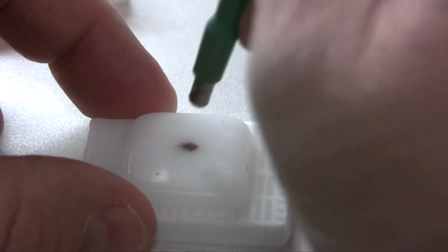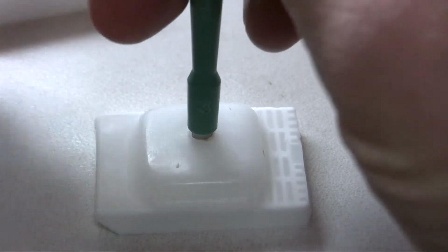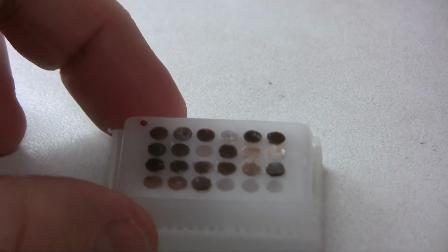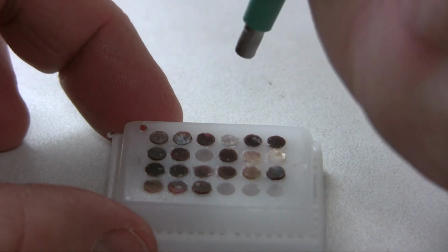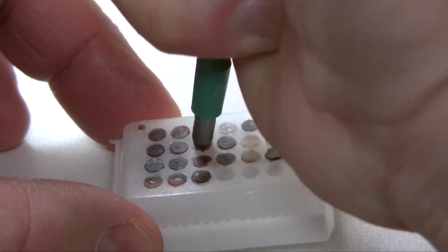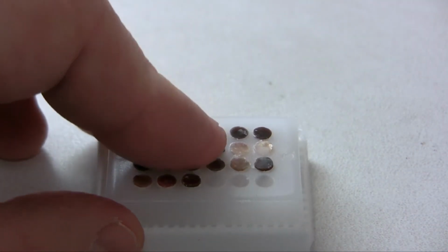Now I am punching the perpendicular embedded tissue. This time the cardboard stayed in the needle.